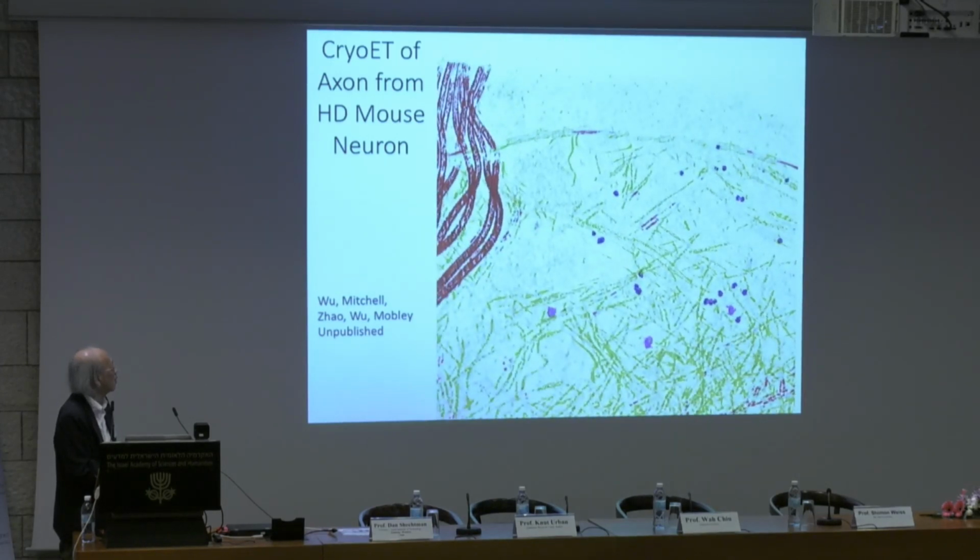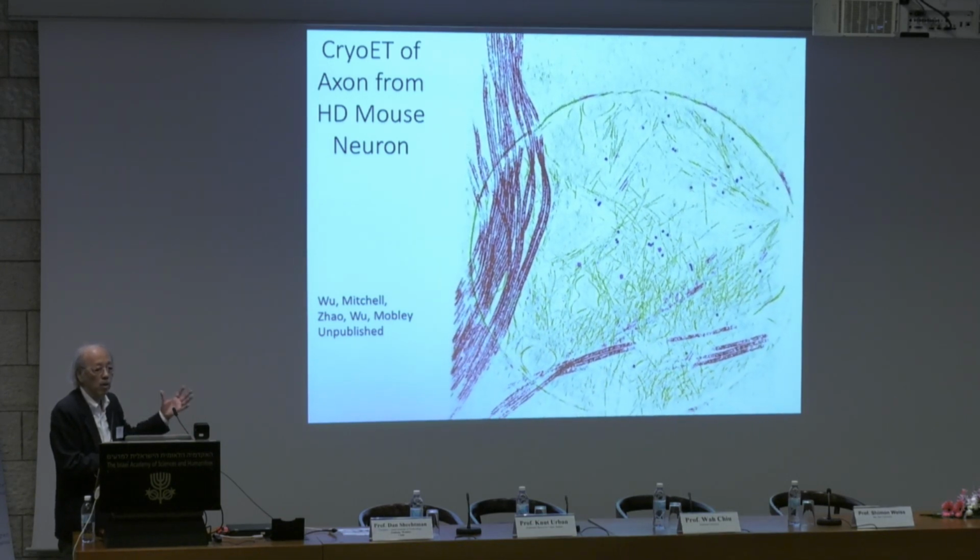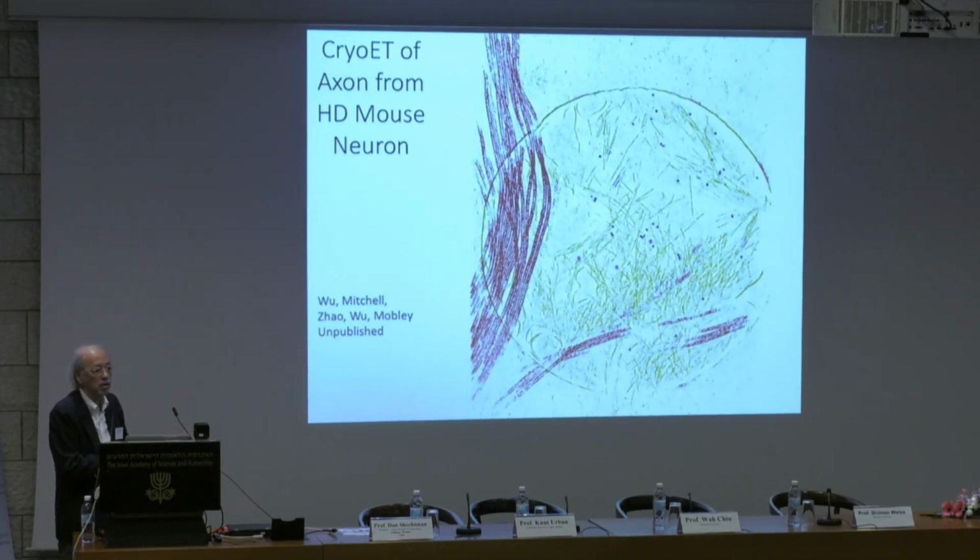So this is, I think, truly exciting because now you can do the deep learning from a tomogram to this color picture in actually an hour. Okay, so then from there we can actually segment different regions to do analysis.